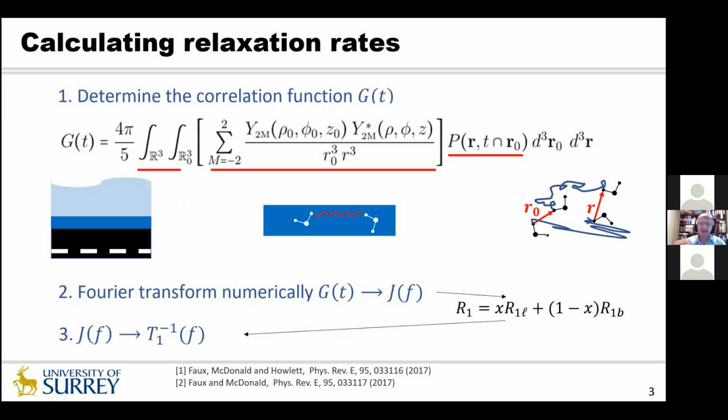And the time scale of measurement is deemed to be the value of T1. T1 at its minimum is around about a millisecond, and we will see that the correlation times for the motion of the bulk water or the surface layer water can be as long as about a microsecond. So throughout, this fast diffusion limit is satisfied.